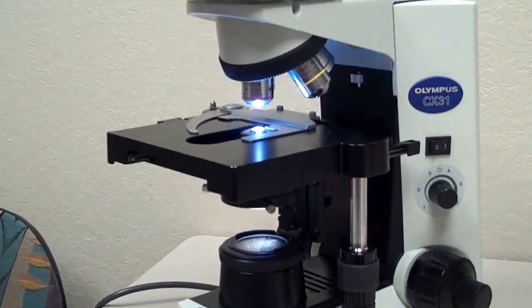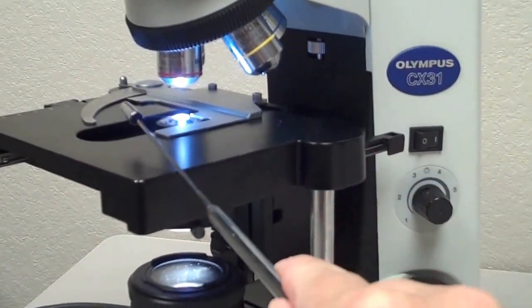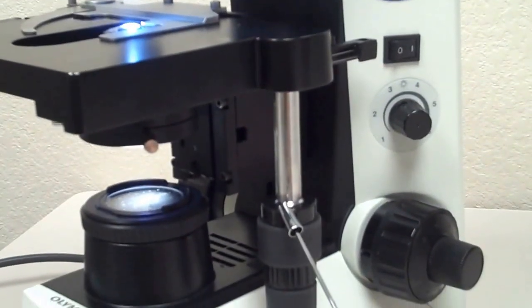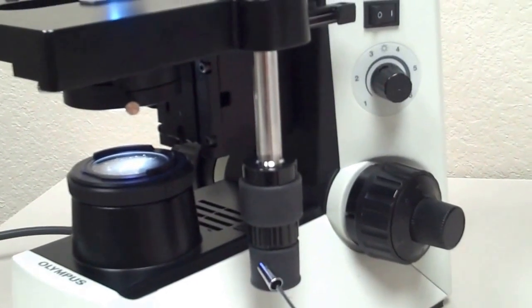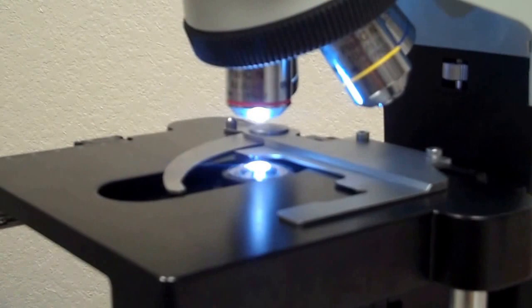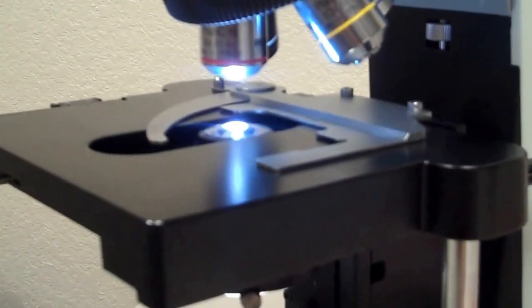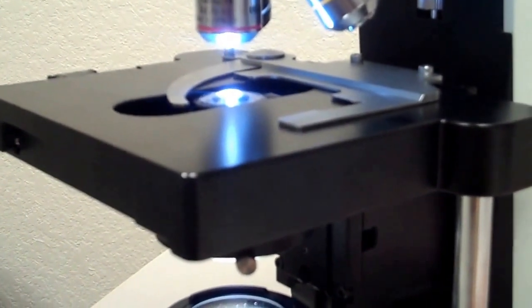The mechanical stage is where your slide sits so you can view it underneath the microscope. The mechanical stage adjustment knob is on the right hand side — a silver stick with two knobs on the end. The lower knob moves the stage left and right, while the upper knob moves the mechanical stage forward and back. You use the mechanical stage to center your specimen in your field of view.